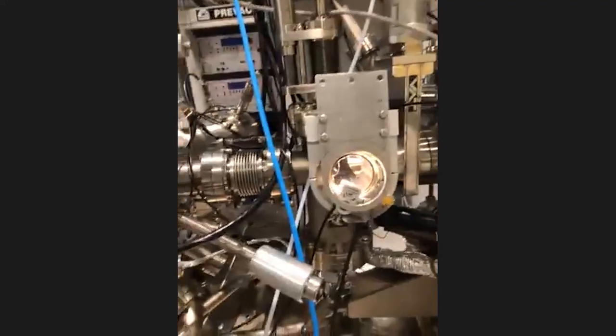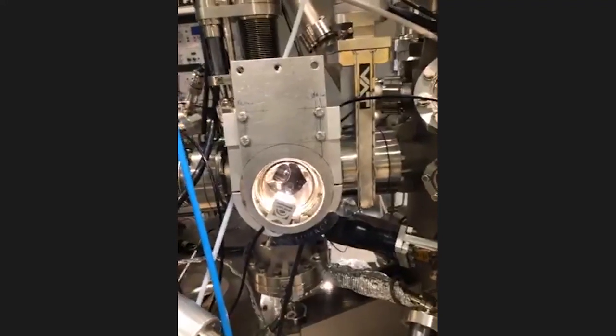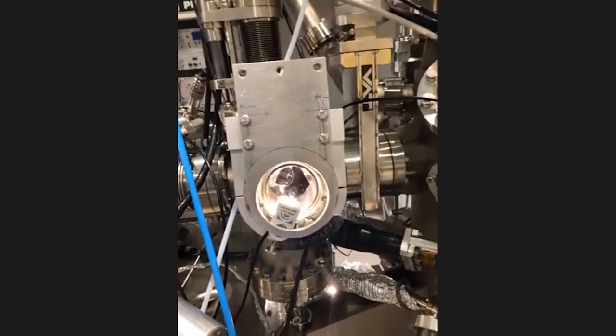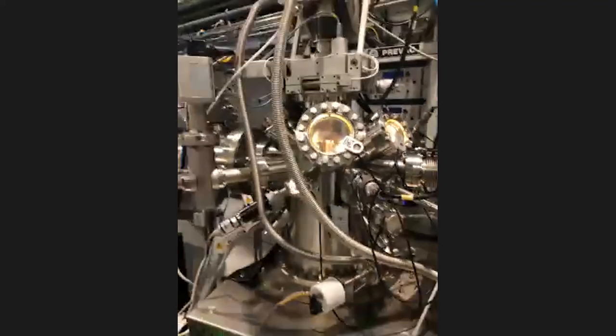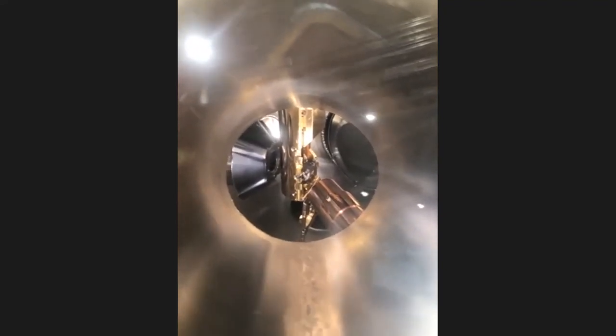The next one is the so-called storage. Maybe it isn't seen well right now because I cannot show you everything, because we are doing measurements. The storage has places for 12 sample holders. The next one is the analytical chamber. I can show you the inside of it. You can see the cryogenic manipulator with 5 axes. This manipulator is filled with liquid helium, and we can reach a very low temperature, even 7 Kelvin. Okay. Here's the core chamber.